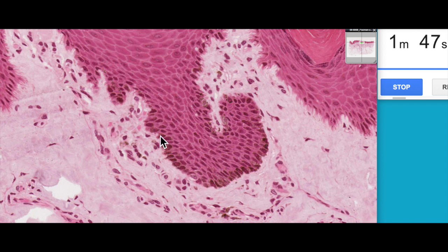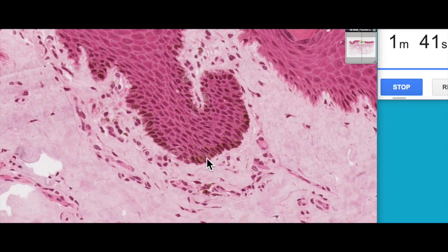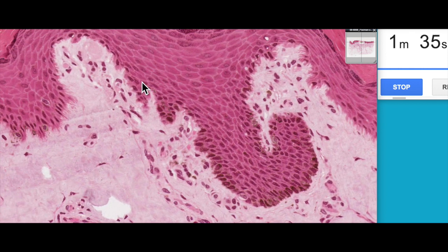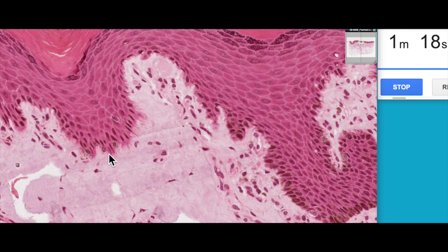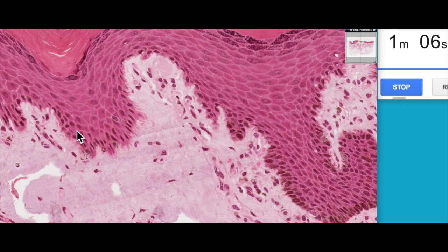The stratum basale is one cell layer thick, made up predominantly of keratinocytes. Those keratinocytes often have melanin granules associated with them, passed on by another cell type found within the stratum basale known as melanocytes. Here's an example of a melanocyte, and here's an example of a keratinocyte. You can see the keratinocytes have an interdigitation of their cytoplasm with the underlying basement membrane, which increases surface area for contact to resist abrasion — particularly important in thick skin.